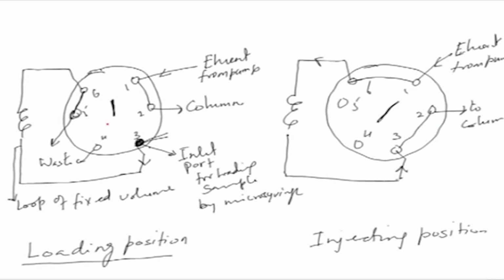Again it will be brought to the loading position, and then again you have to do the same thing. These will go to the waste actually, both of them. So, this is a very good system, the injector loop, which could be used for loading or for application of the sample. All right. So, let us return to our discussion.